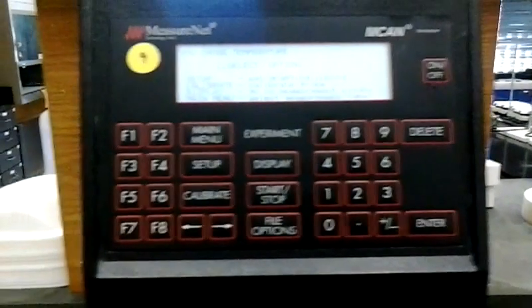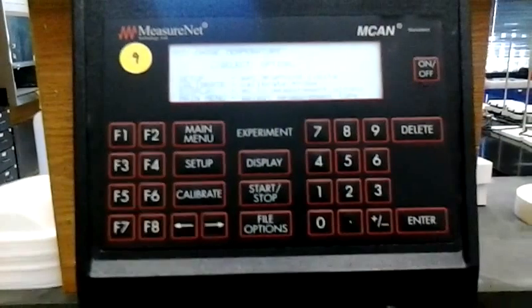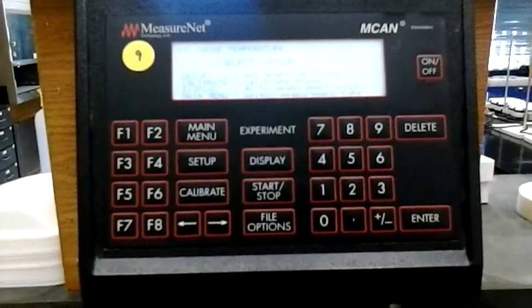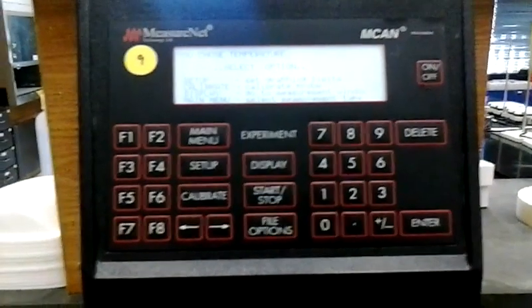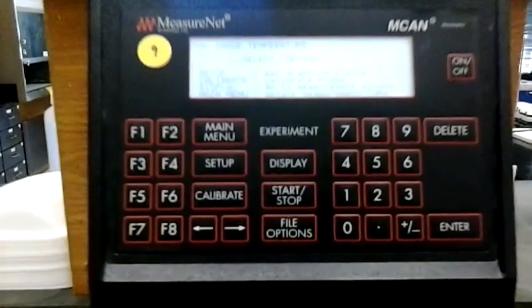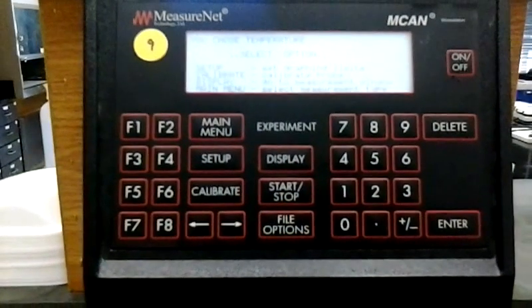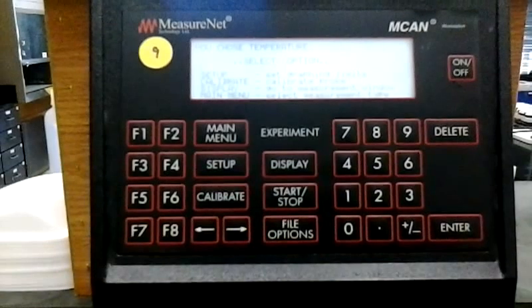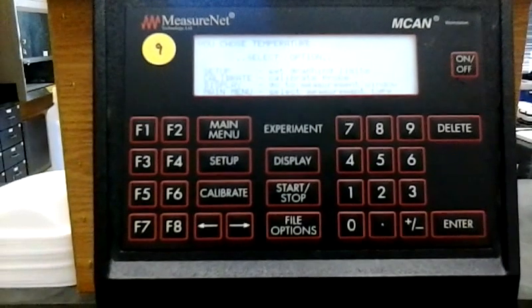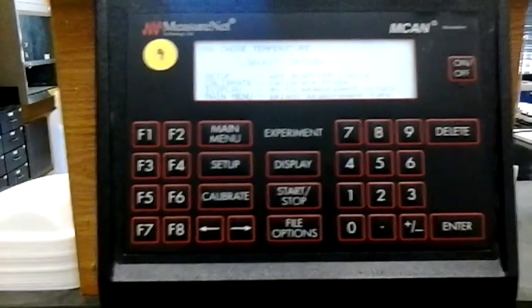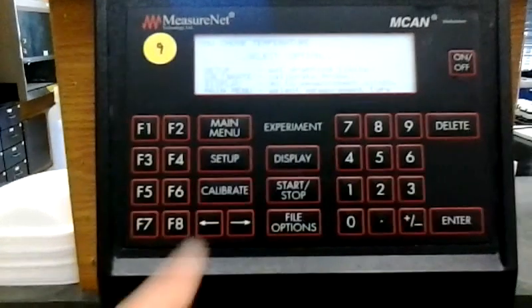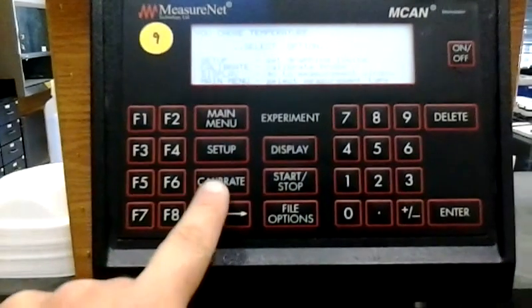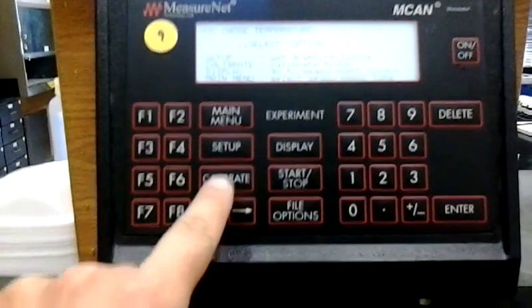And now it gives you a set of four different choices. You can have setup, you can calibrate, you can display, or you can go back to the main menu. So what we're going to do is we're going to calibrate our temperature probe. So you need to hit the calibrate button here.